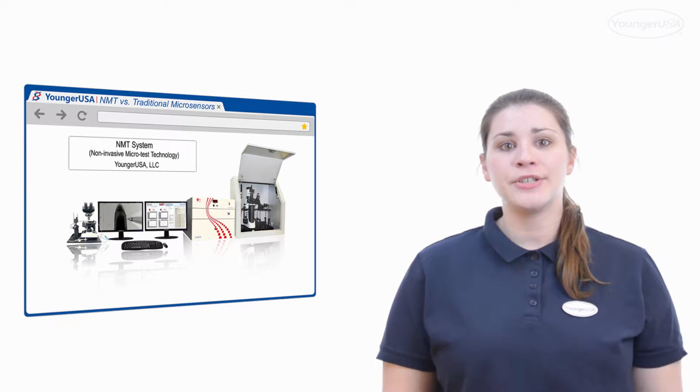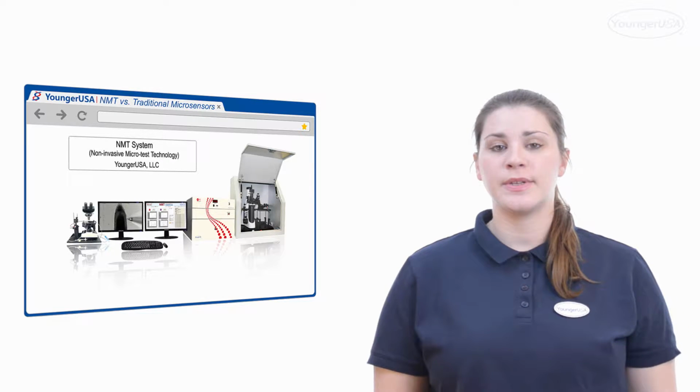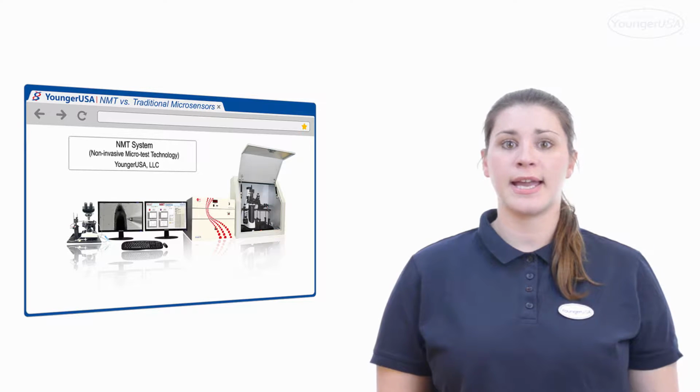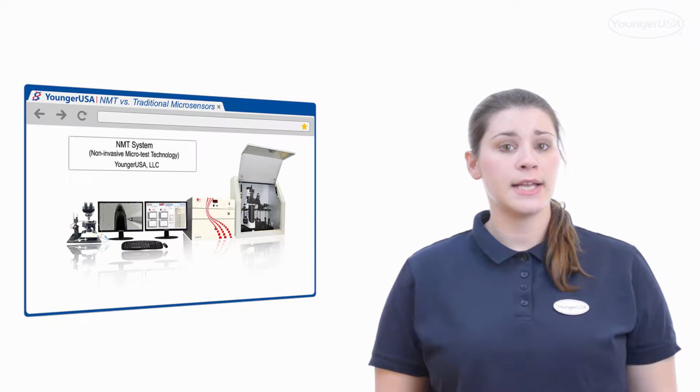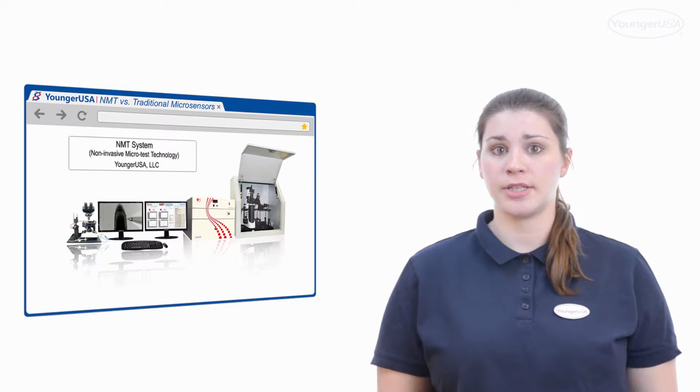Everyone! Today I'll show you some important components of NMT. I'll then go on to show the difference between studying ionic activity using NMT as opposed to traditional microsensors that are based on microelectrode technology.